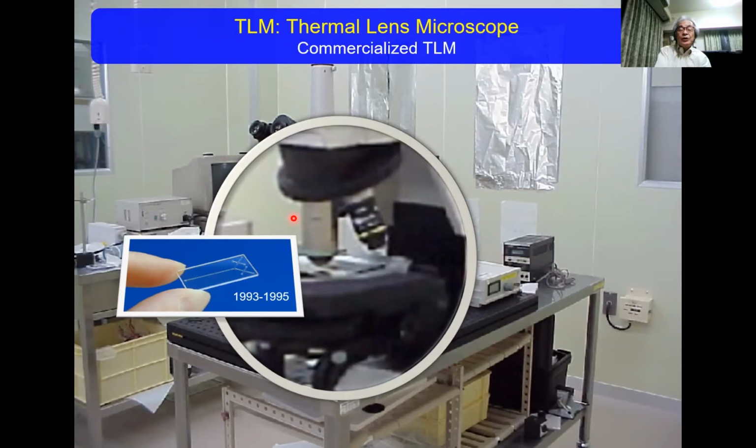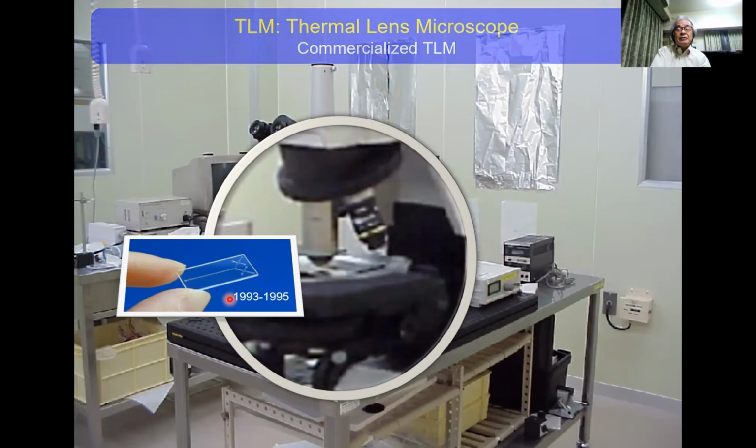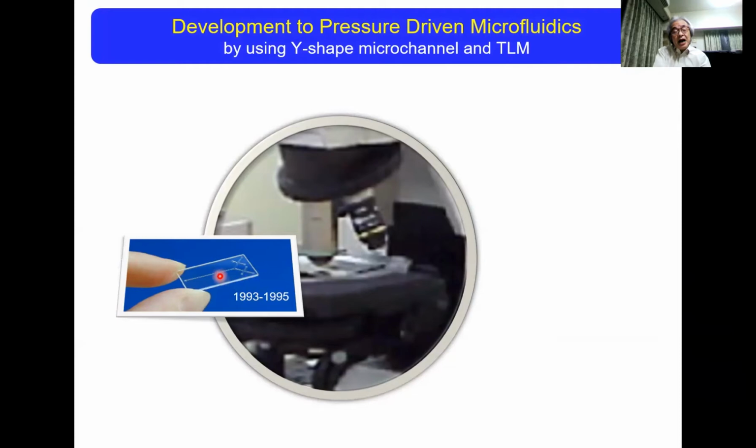And so the reproducibility is dramatically improved by using this device. After succeeding in developing the thermal lens microscope, we applied this device to mixing and inducing a chemical reaction. After that, we introduced an immiscible aqueous and organic solution, and we succeeded in the extraction. In this way, this device is the origin of microfluidics, especially pressure-driven microfluidics.